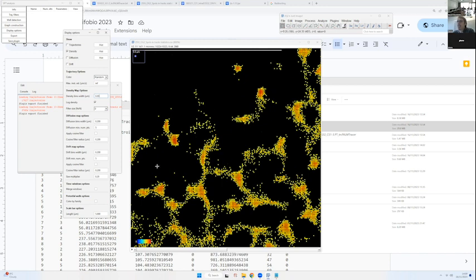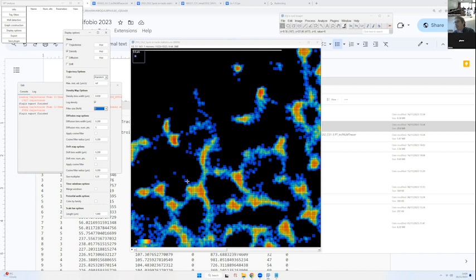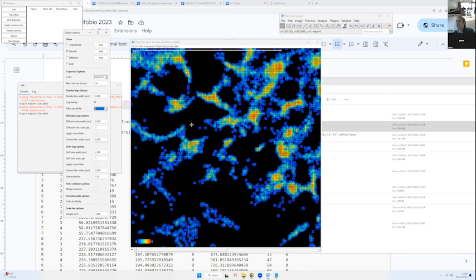And if I want to reconstruct something a bit smoother, I can apply a local average filter of size n by n. So there are multiple sizes I can choose, 3, 5, etc. For example, if I do 3, now you see it computes a local filter. If I choose 5, now the map will be smoother.